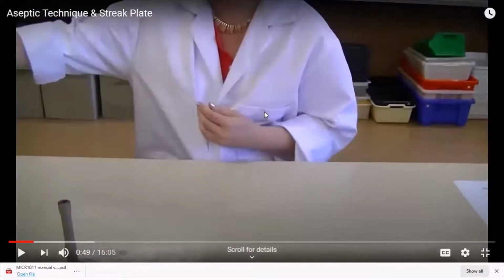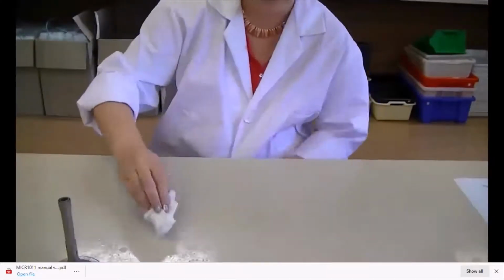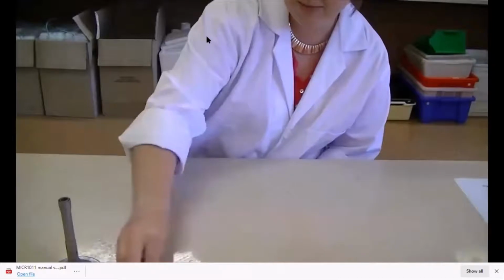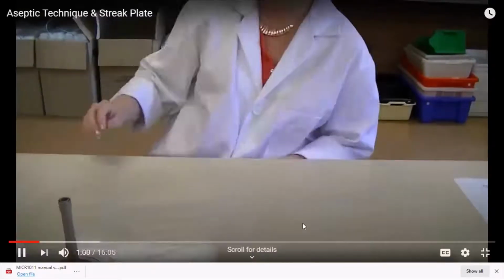Okay, and the bench cleaner, guys, is usually about 60 to 70% alcohol that we use. Don't let anybody tell you that we use full bleach or anything like that. We usually have to add water or something, so it's never a full concentration of anything. It removes any dust or unwanted organisms that may be on the bench. So wipe down the disinfectant with a tissue or some paper towel provided and place that in the bin.